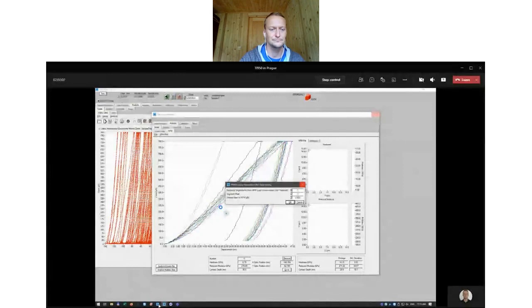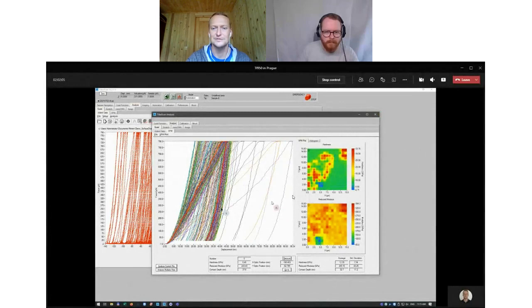Okay, so now it's done. So we see a distribution of properties, especially for hardness. The hardness values show the different hard phases. And in the modulus, it's almost about the same, but the hardness is very different for metallic samples. So we were actually pushed by the users in that field to really develop a fast hardness mapping. So that's all what I wanted to show.